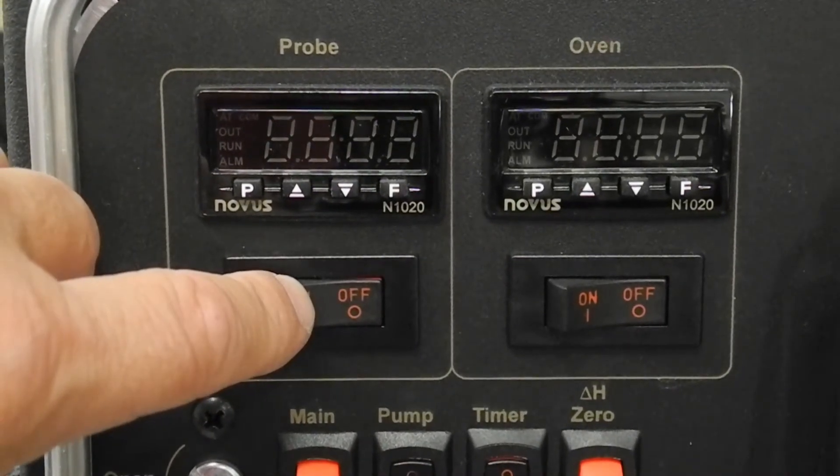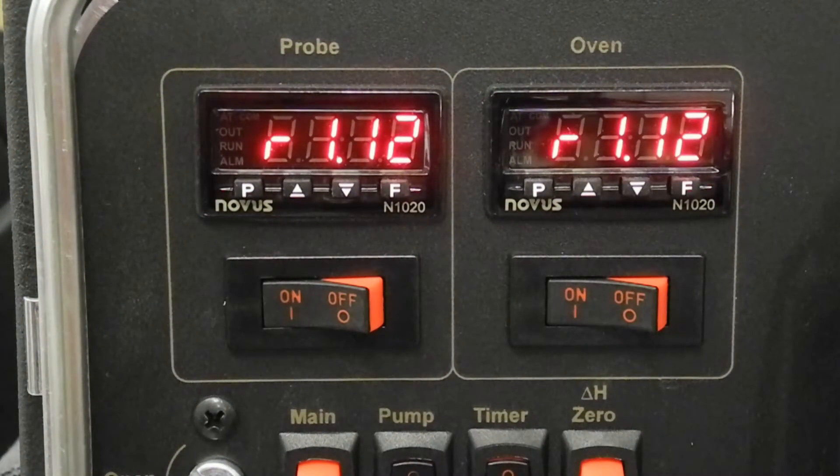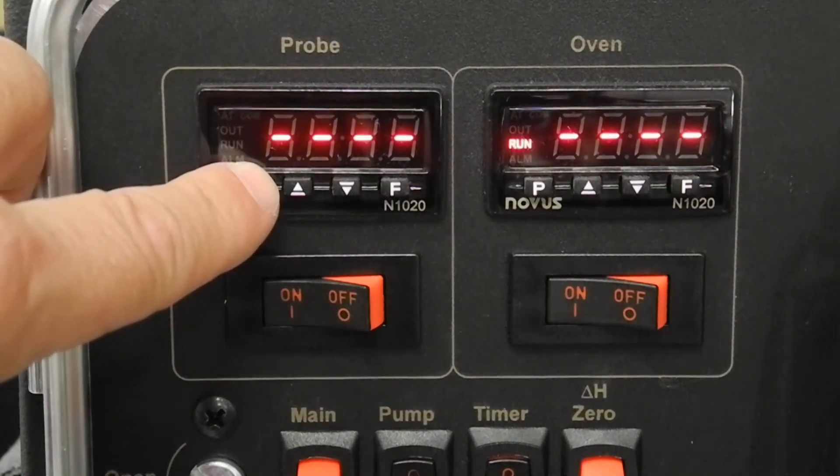To begin the quick setup procedure, switch on the console and the temperature controllers. The firmware version will be displayed immediately. After several seconds, the displays will show all dashes.